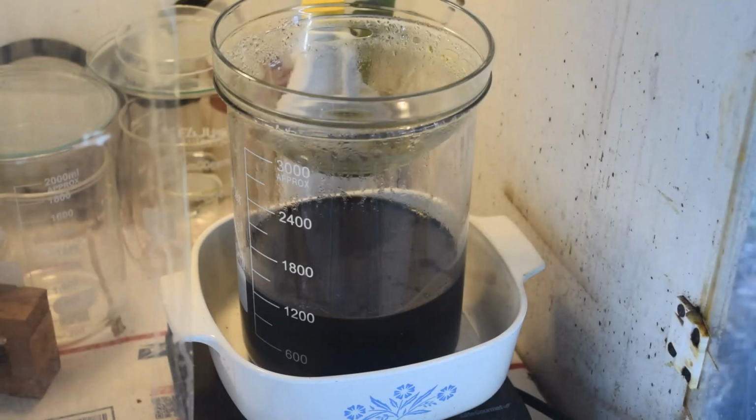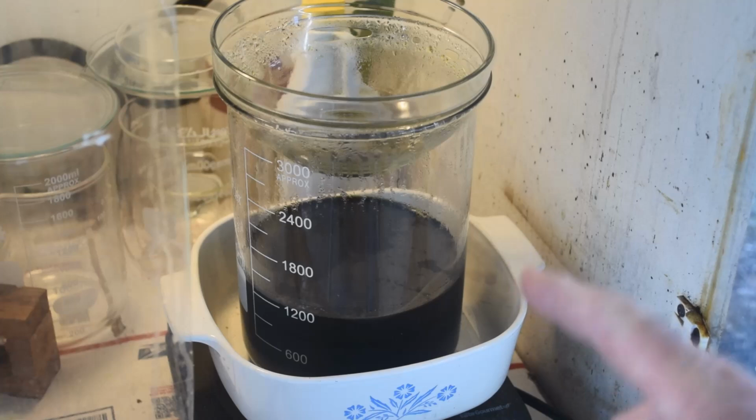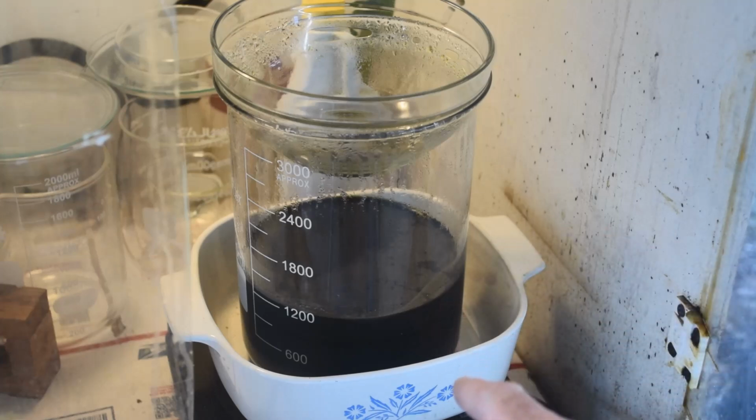Well, this took a whole lot more time and acid than I thought it would. And I'm not 100% certain it's done. This is its third treatment. And this time I've just added some more acid to it a couple of times. It's been on here for days. I've been too busy to deal with it. I'll come out and turn the heat on when I think about it.